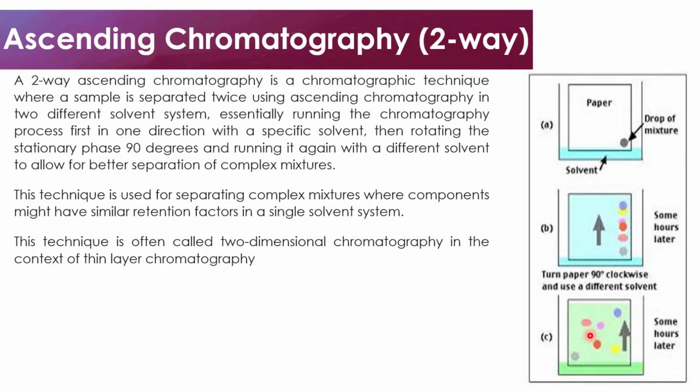One thing I would also like us to look at: we can see that the mobile phase in setup A and B has the same color, but that of setup C, which happens to be a different mobile phase, has a different color.